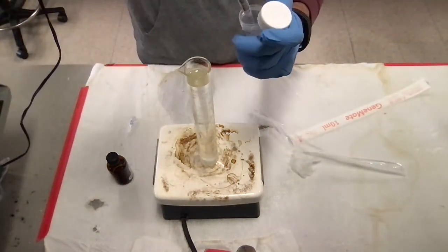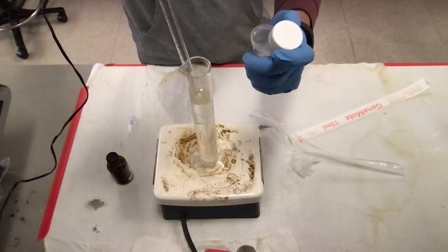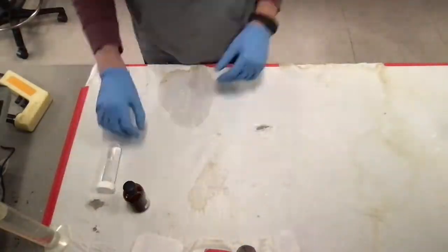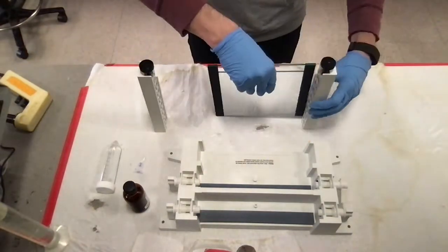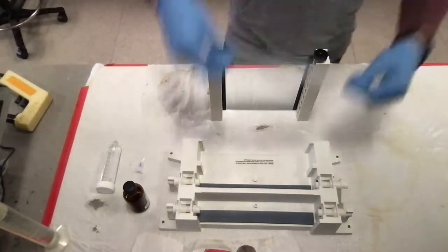Formamide should really be done in the hood. So I went ahead and put 5.5 mils of that into the test tube and then added 40 mils of our denaturing gel solution. You can see here that I'm putting together the gel box and screwing that in. The first thing we're going to do for this is check for leaks.